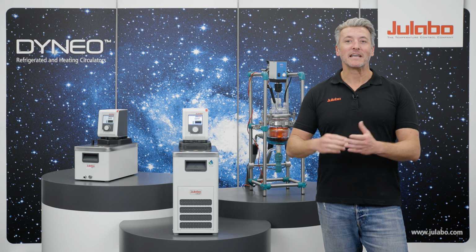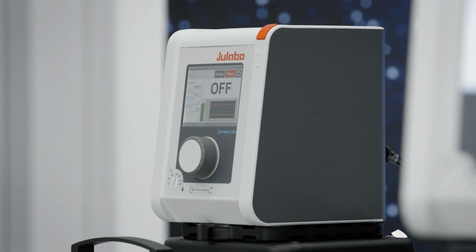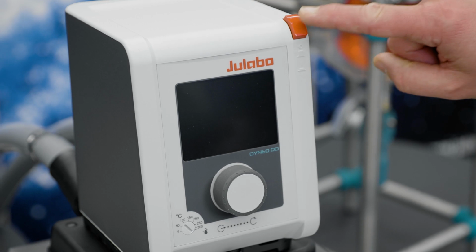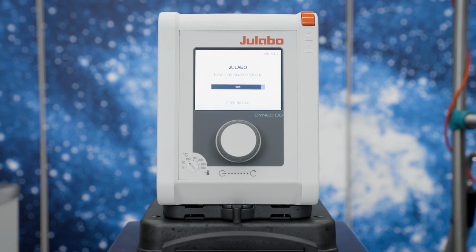My name is Alex and today I will show you the basic settings of your DYNEO circulators. All display functions are easy to operate with a central rotary knob. The device is conveniently switched on and off via the main switch. At startup, all display elements light up briefly while the software boots.